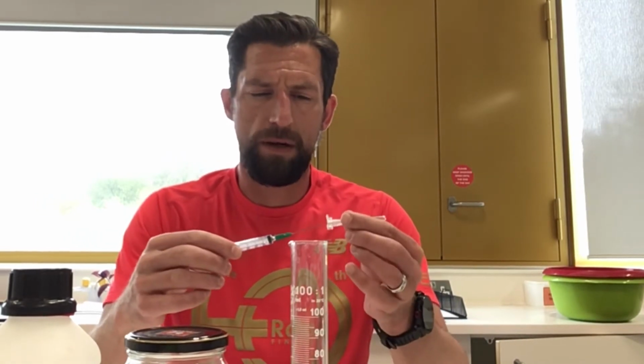And it's important that you fill all the body cavities. So I'm going to work along the snake roughly every inch, injecting some of my formalin into the body cavities, and that preserves the internal organs and the tissues and means that it won't decay. Then once I've injected the snake all the way along, I'm going to put it into my jar.